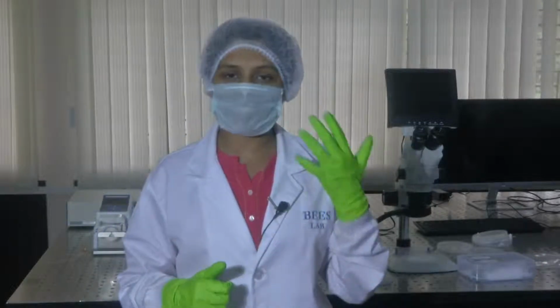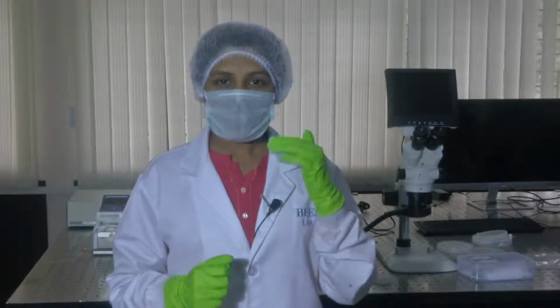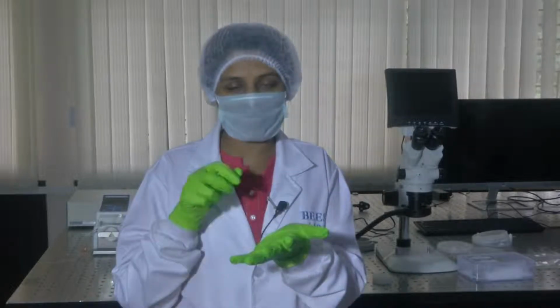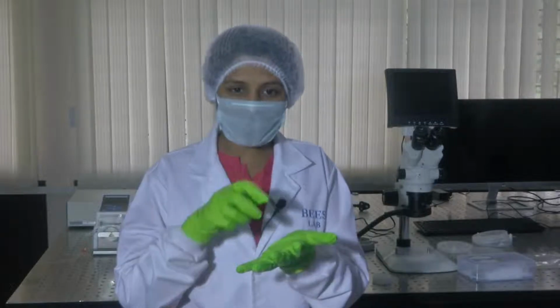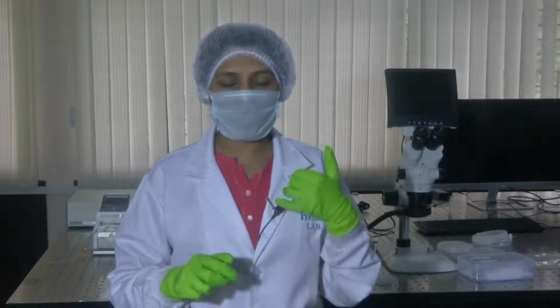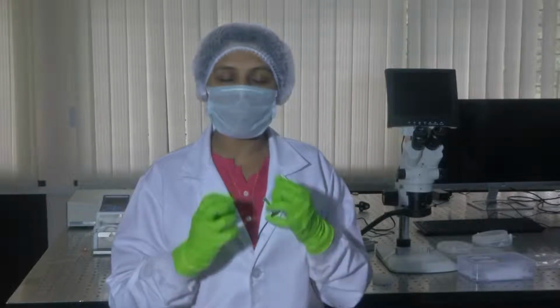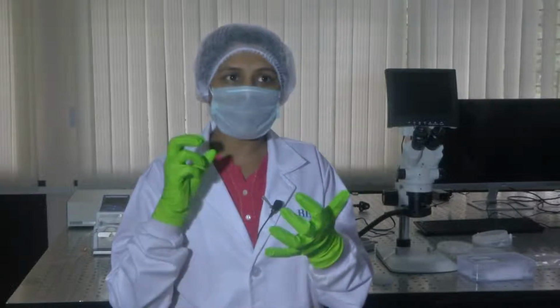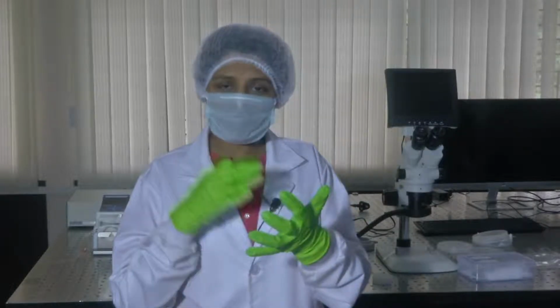Now that we know what lab on a chip and organ on a chip are, you understand that we are driving liquids through these microchannels. So, the liquid driving mechanism becomes very important to us. How do you drive liquid? I am sure you have all heard of blood being pumped to various parts of the body. When you are talking about pumping, a pump mechanism is nothing but a driving force to push fluids, liquid or gas, across the channel.